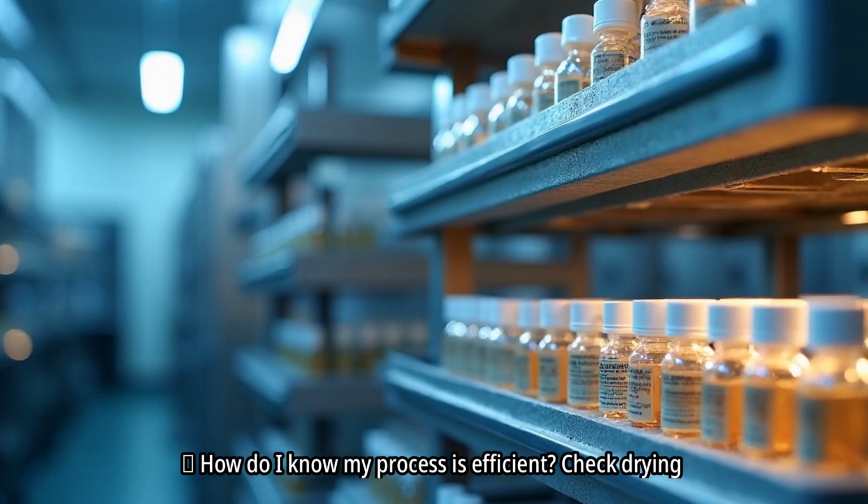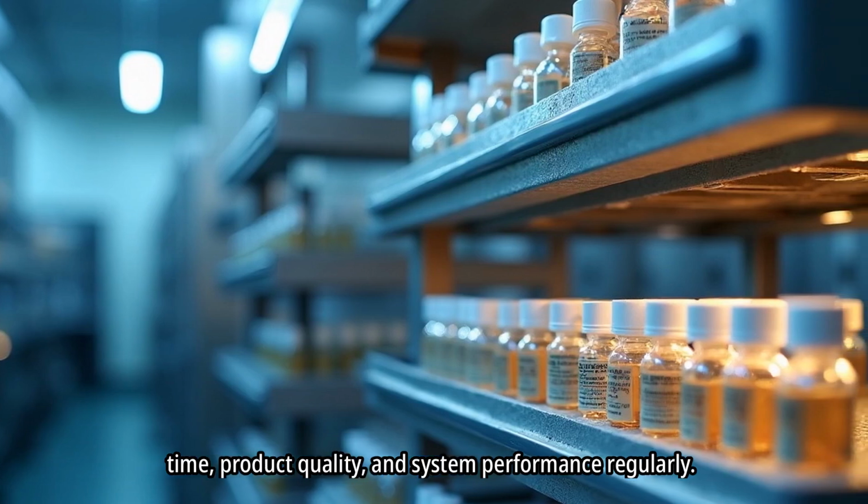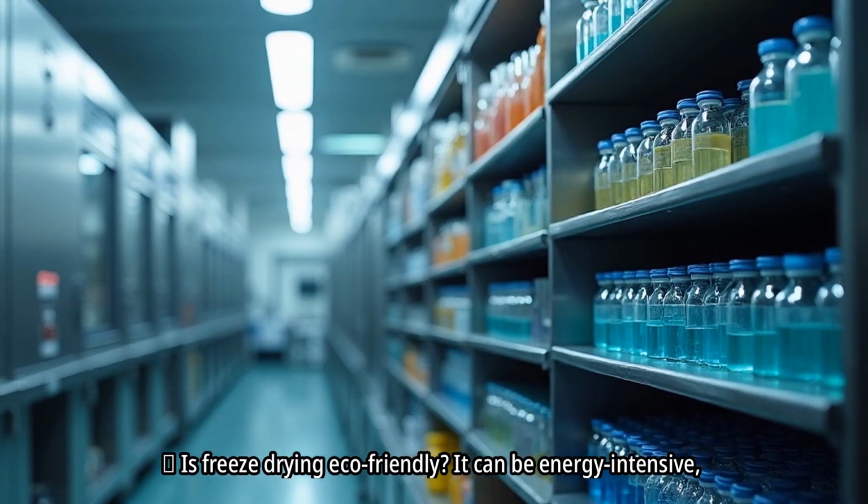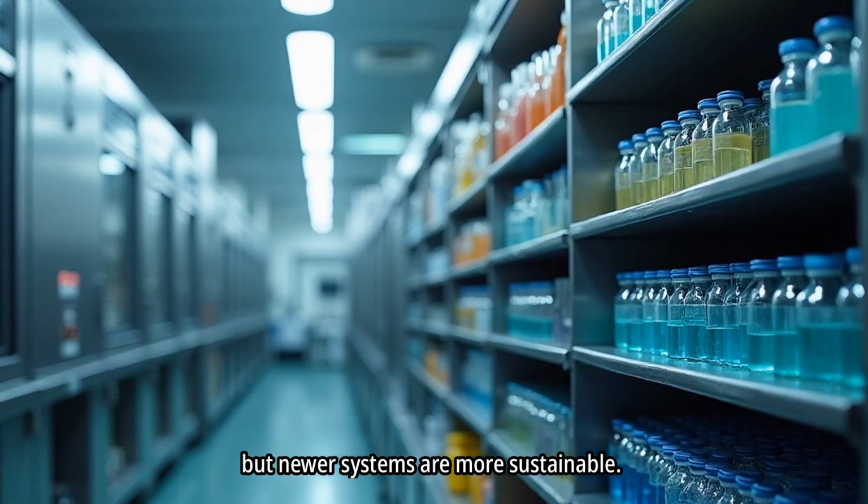How do I know my process is efficient? Check drying time, product quality, and system performance regularly. Is freeze drying eco-friendly? It can be energy intensive, but newer systems are more sustainable.